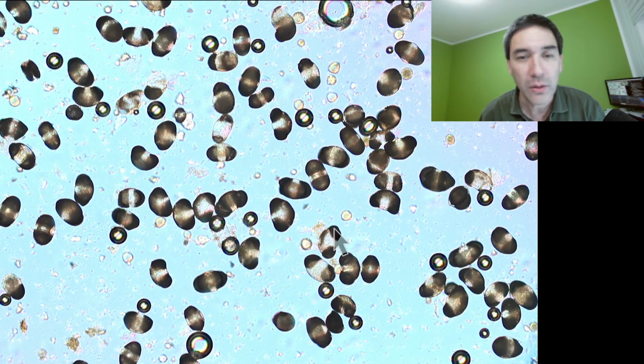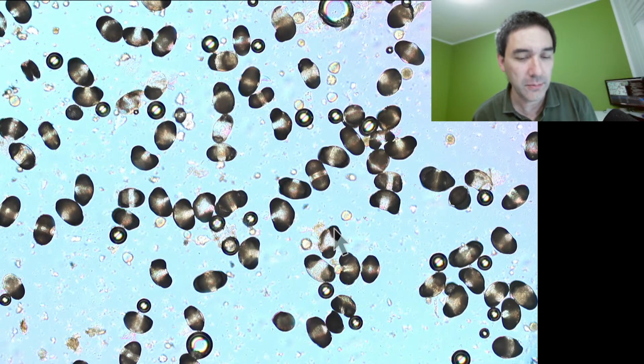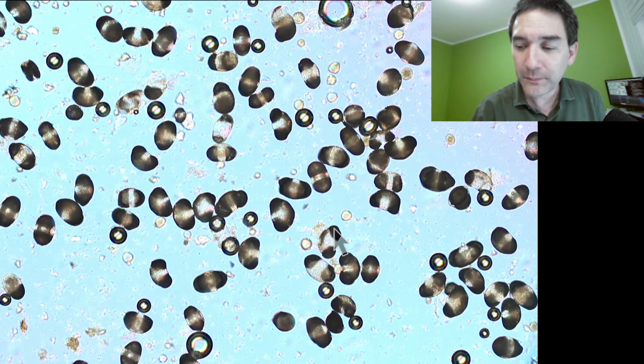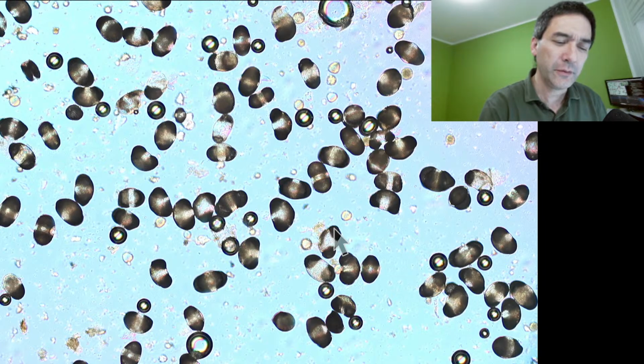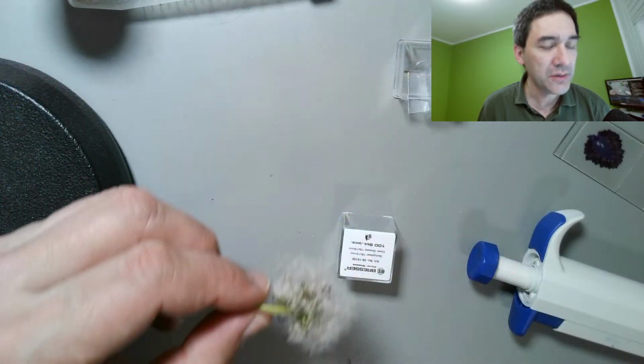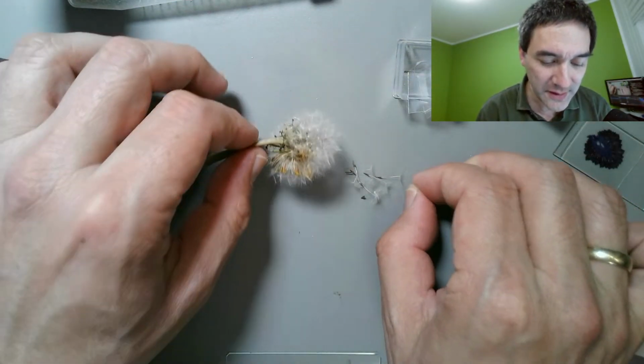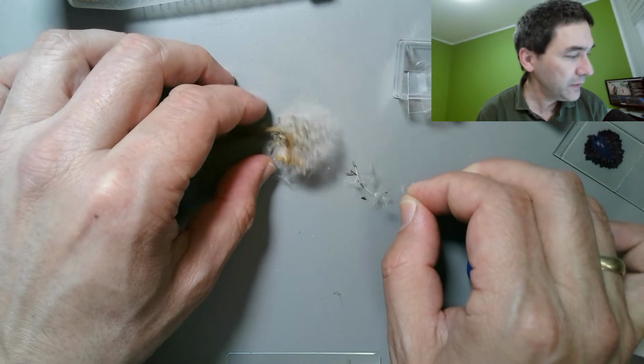Okay, so then what I'm going to do now is just a little bit for fun, because this has a little bit of a tradition already, even though I already know what to expect. It also looks kind of like, you know what this is, right? Yeah, a dandelion seed, and just for the fun of it, let's have a look.